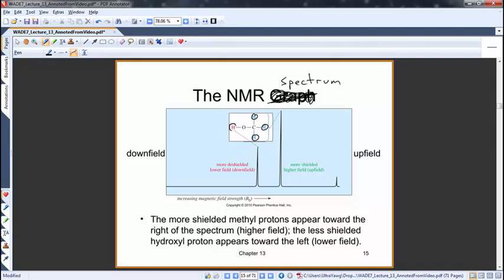If I was this guy, however, and I'll put it in a little box, I would say, I'm a hydrogen that's bonded to an oxygen that's part of methanol. That's very different. Oxygen is not carbon. And so this guy is one signal, and these three collectively will be another signal. Each one of these things is called a signal, not a peak. The size of the signal is directly related to how many protons make that signal exist. So if this is size 1, this has to be size 3, because there are 3 of them that make it happen.